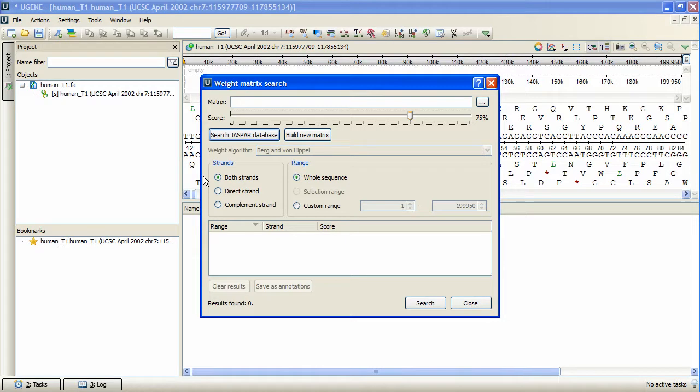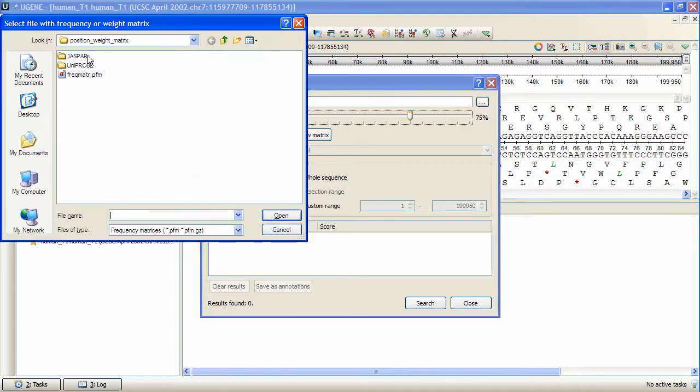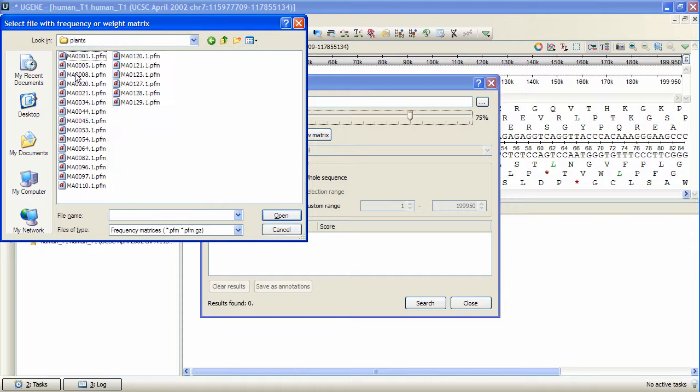There are several ways to define the matrix. To start with, Eugene package contains local copies of JASPAR and Uniprobe databases. By pressing Browse, we can select a matrix from one of these databases.